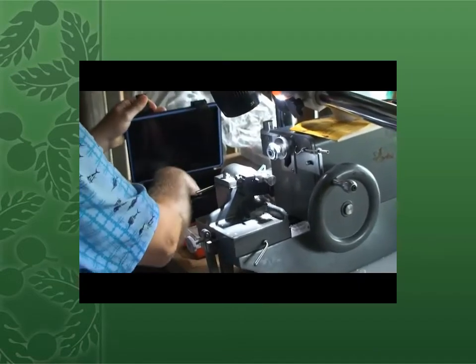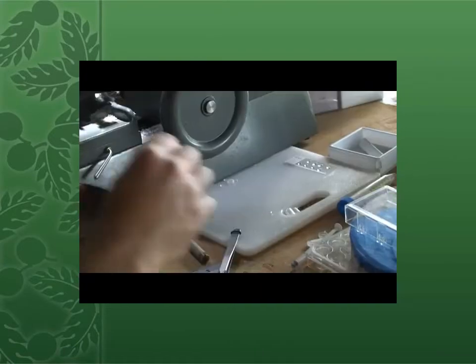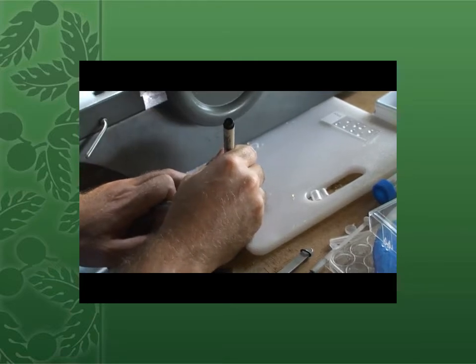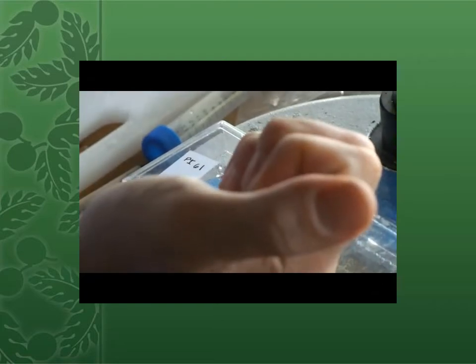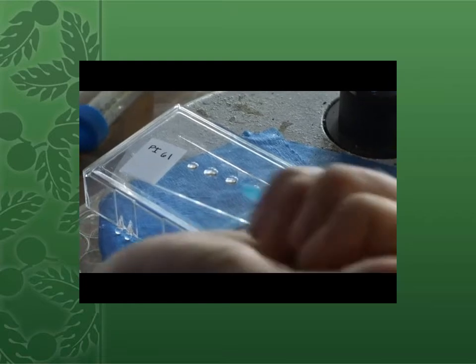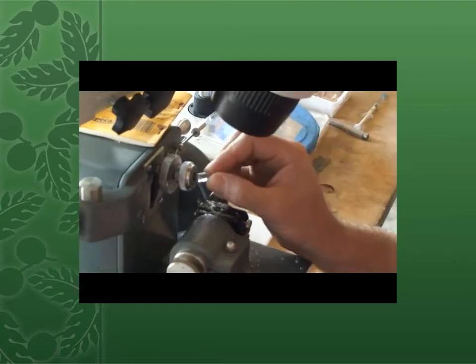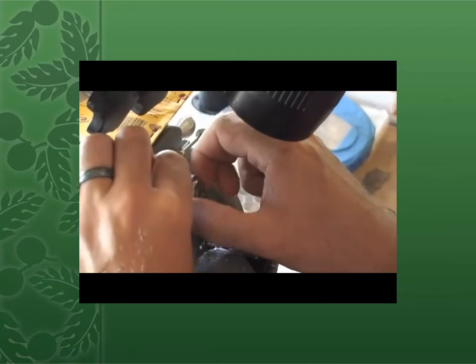Later, you'll take that stub out of the desiccating chamber, look at the number on the label, and record that number on a glass microscope slide. Prepare your slide to receive tissue sections by placing 10 drops of water on the slide. Place the stub into the microtome, which is a piece of equipment that you'll use to make thin sections of the gonad.